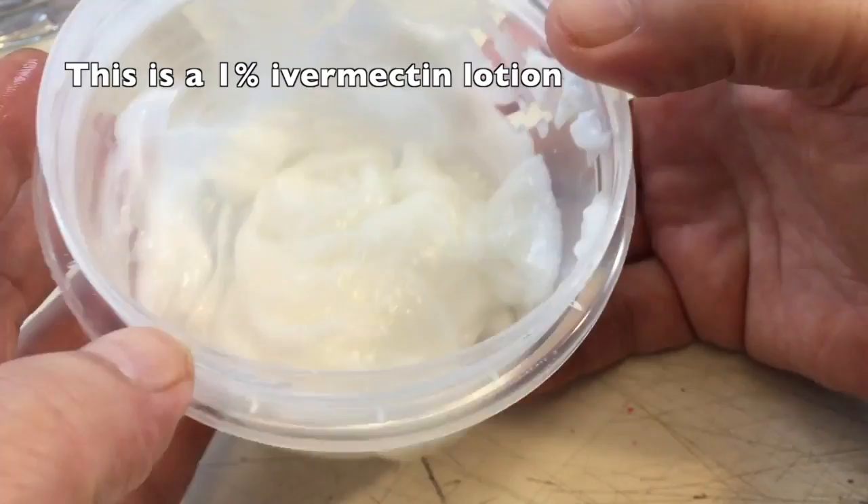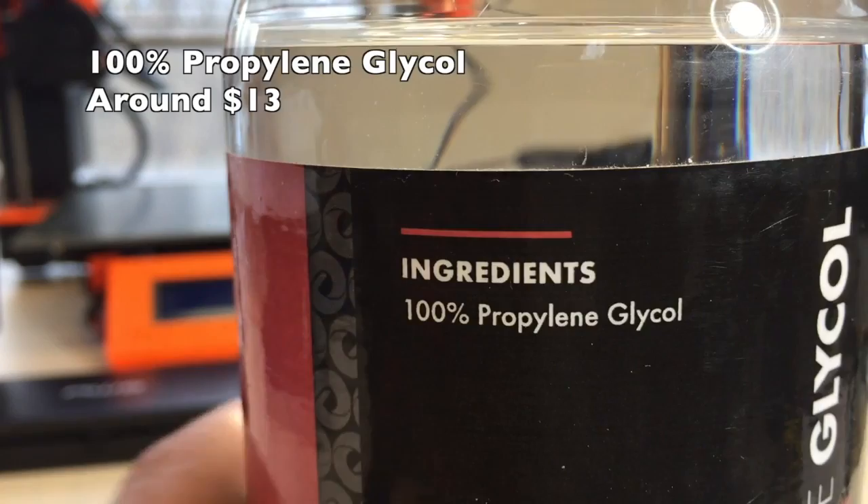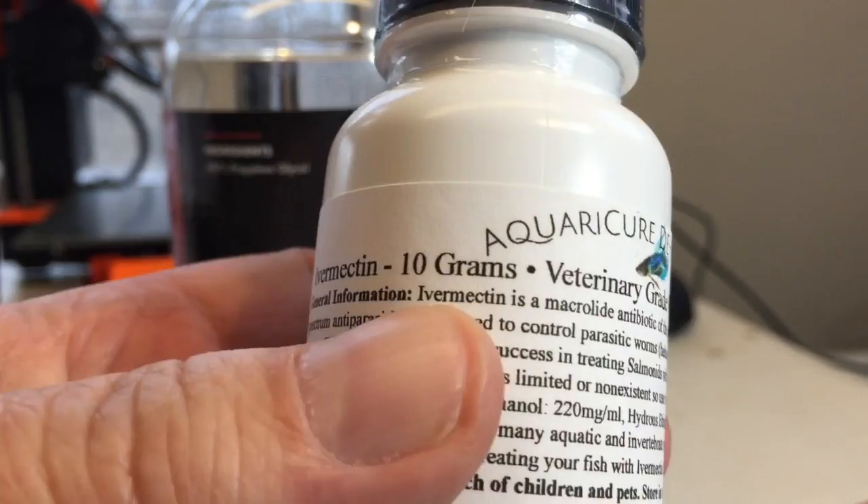So let's see if we can do this. Here is the lotion that I made — I'll show you how I made it in a minute. You can see it just looks like a regular hand lotion. The base is one hundred percent propylene glycol.